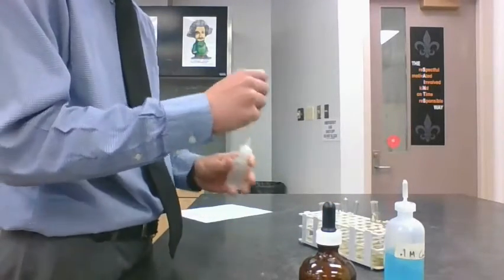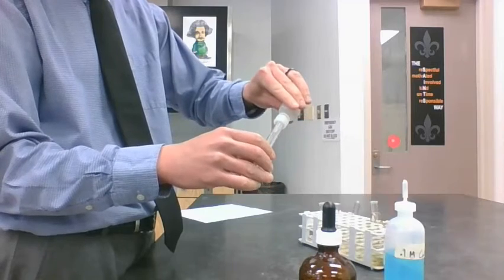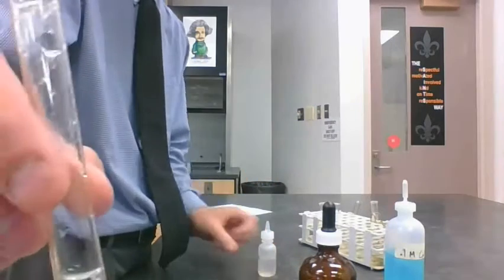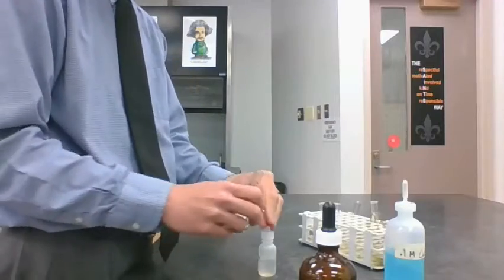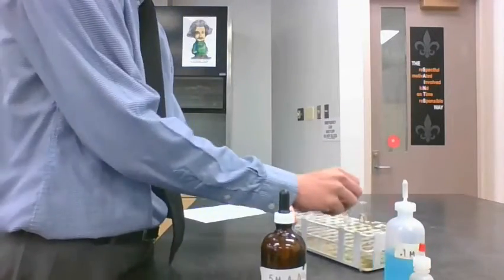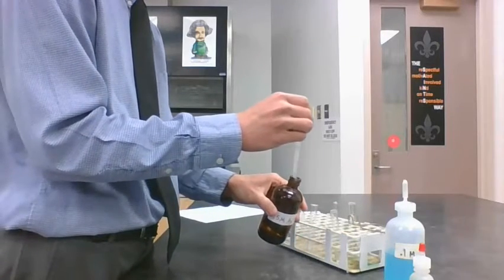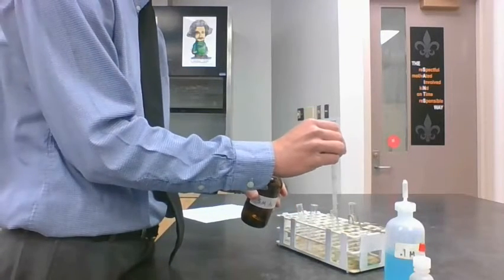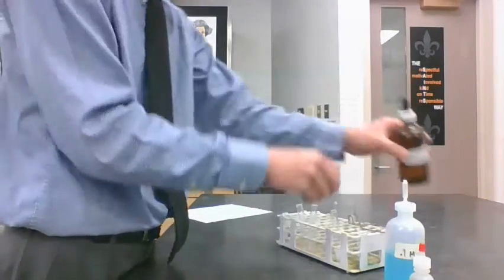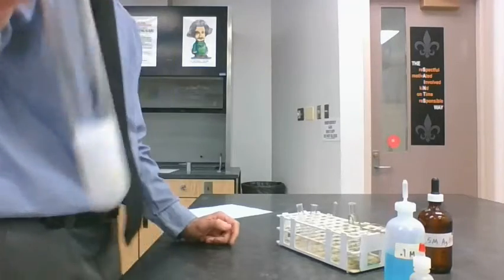So what we're going to do is add a little bit of HCl to the test tube. And then I'm going to do the same thing with the silver nitrate while it's in the test tube rack here. I'm going to be careful on this. Add a few drops of that silver nitrate from this bottle. And let's see what happened. So we had two clear liquids, and let's see, look at that.